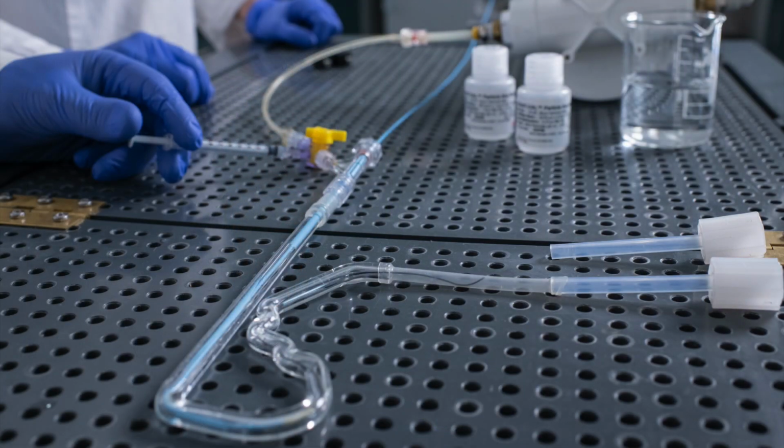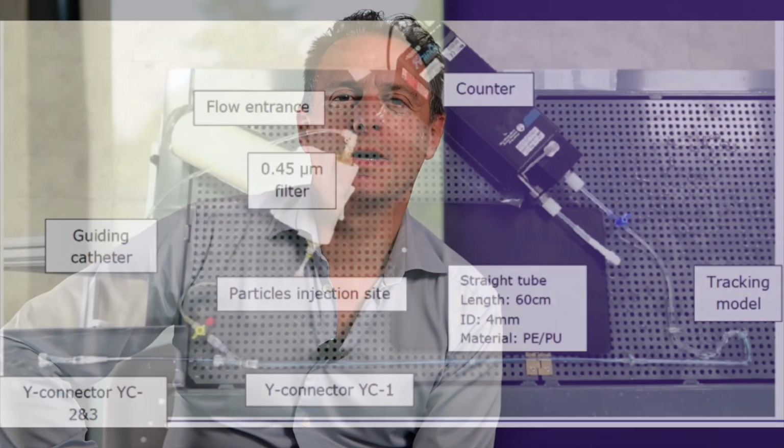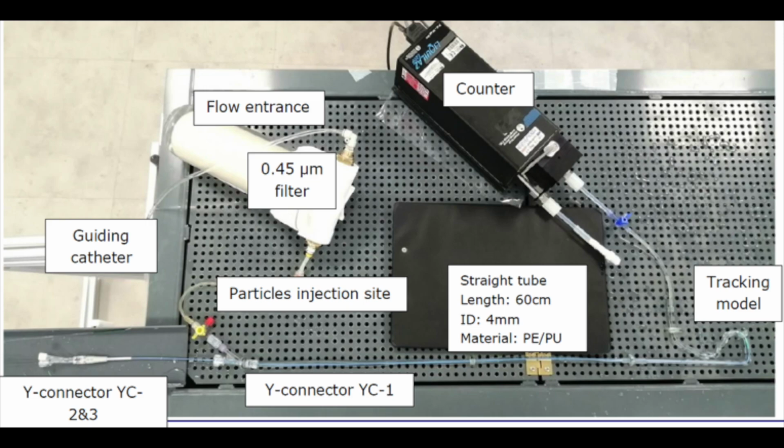Acute particulate matter evaluation studies are sensitive, as coating delamination can induce stroke risk in patients. This is why we're using acute particulate matter evaluation as a perfect example of how an interlab study can reduce patient risk. You don't have to go through 2 years of development to implement a test method validation before you can implement an ILS, interlaboratory study.